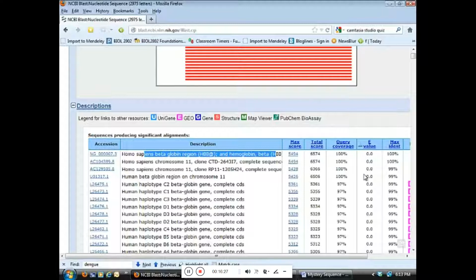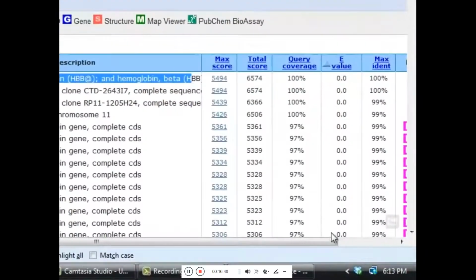Common e-values are things like e to the negative 23rd power. That's a very small number. If you ever had an e-value that was large, like say 1 or 5, you'd want to be skeptical that maybe it's not a very close hit, or there might be some random chance going on.